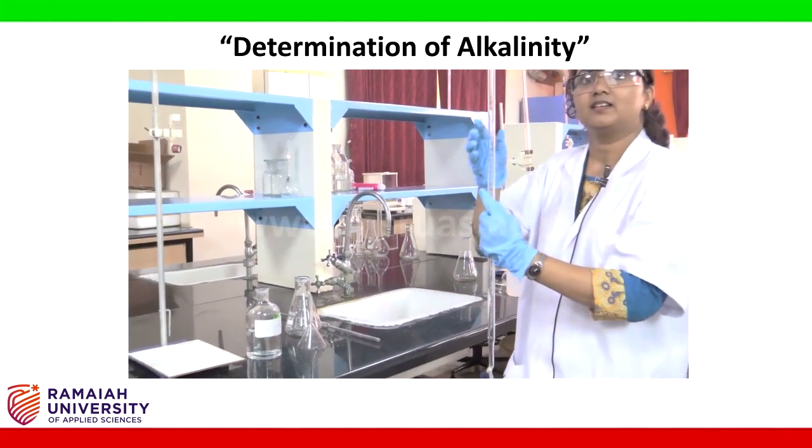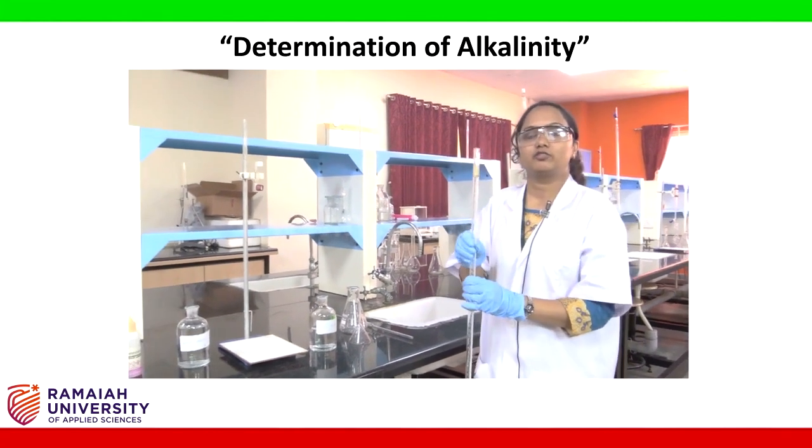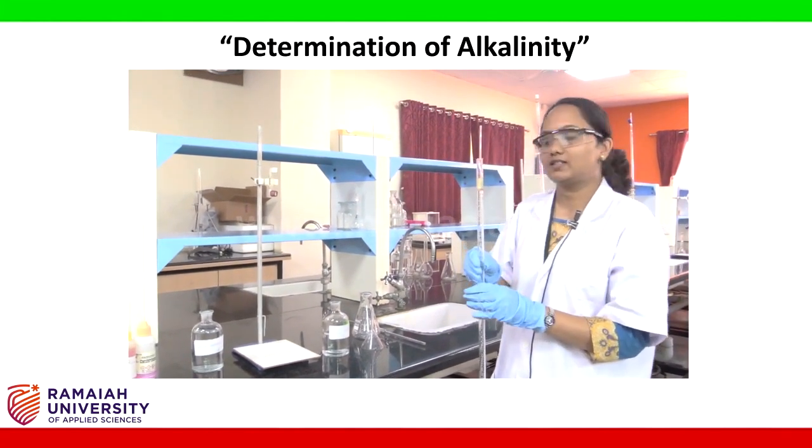So once rinsing is completed, we have to fill the burette with the sulfuric acid.